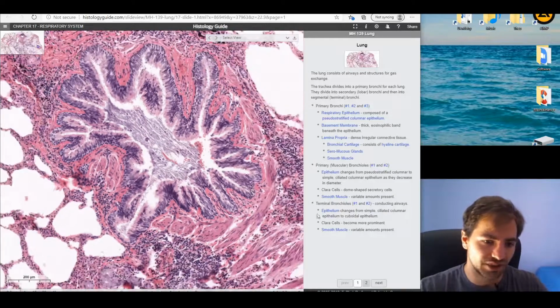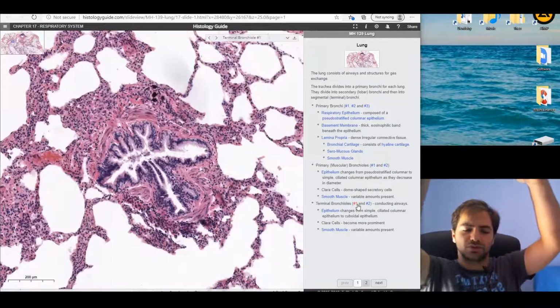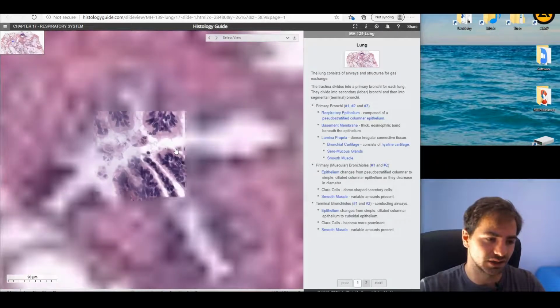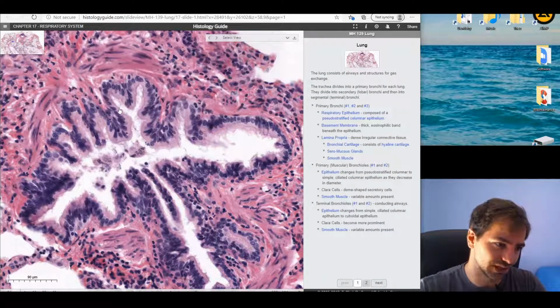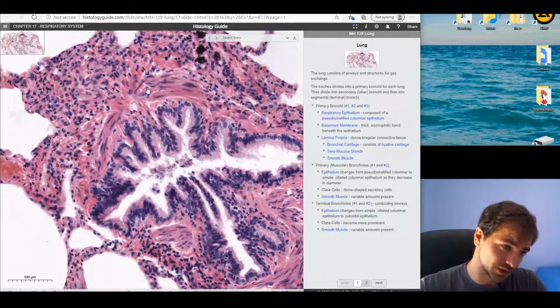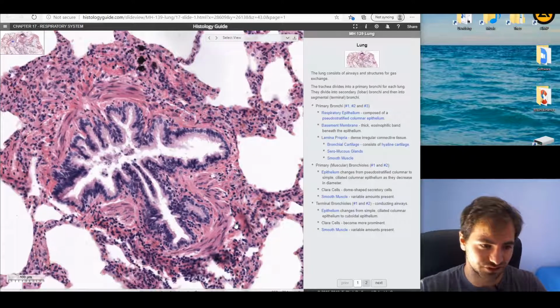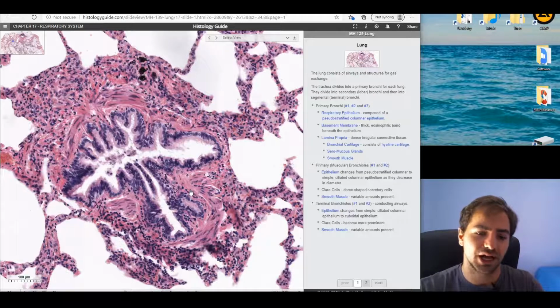So then we're going to find the terminal bronchioles. Again, the difference is we went from the respiratory epithelium to the simple columnar to cuboidal, and now we start seeing short, more cuboidal cells. But of course, we're still going to find the presence of cilia. For example, this is a very nice section where we can find cilia intermixed with mucous membrane. And we can find scattered loose smooth muscle, and surrounding it a very small amount of connective tissue covering the whole section. Now this is the last point of the conducting portion.